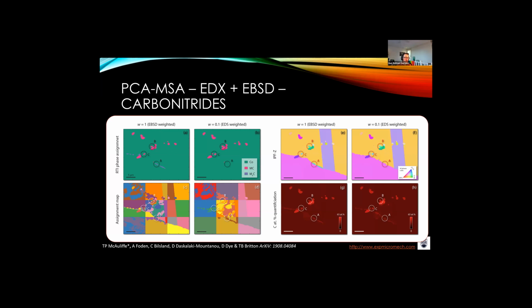There are open source alternatives, so EMSoft, which is built by the Carnegie Mellon Group, and then we also have a tool set called Astro EBSD that can be used for some of this. So there are alternatives that do this. None of the data that I have presented has been cleaned up. I should just comment on this. There's been no data cleanup.